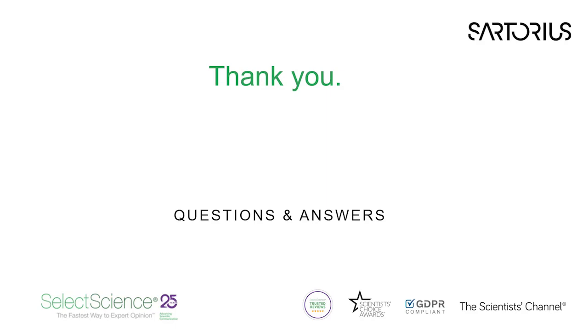Great, thanks a lot for that. And how do I know that my pipette is accurately dispensing? So regular calibration and performance checking is the only way to make sure that your pipette is accurately dispensing. And obviously if you're doing performance checks, then you need to make sure that you're using an analytical balance with a moisture trap.